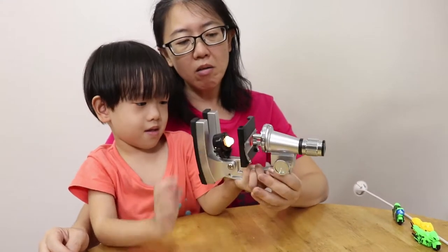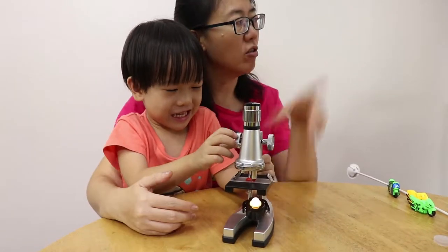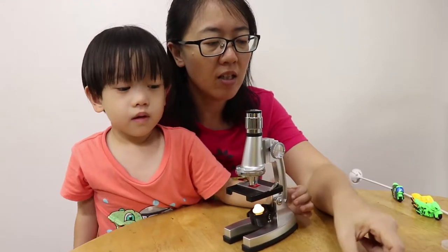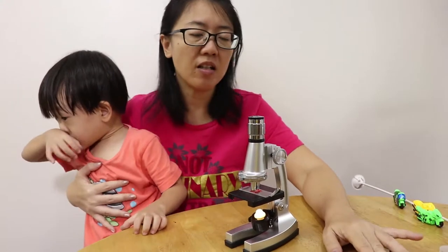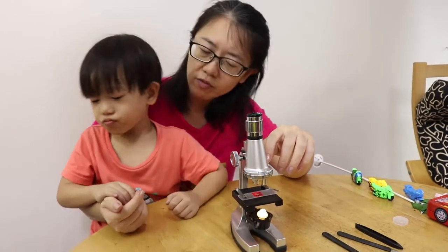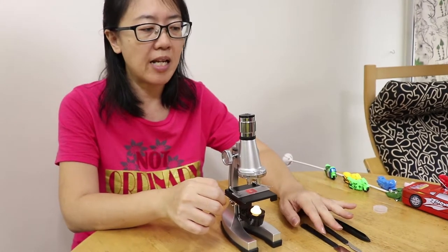So all in all, I guess it's a good fun toy for JC to take out into nature. It's very portable and very light. We'll probably go find some leaves, and maybe examine some dead insects. I guess this is a decent toy or item for less than $50 shipped. It's a good learning tool to make him more interested in nature and science.